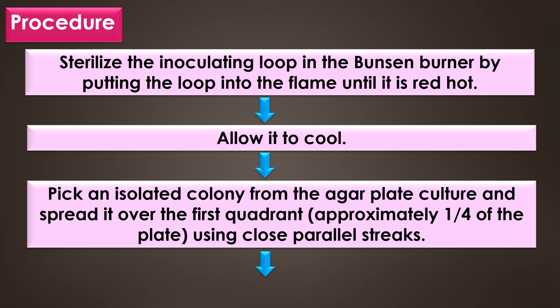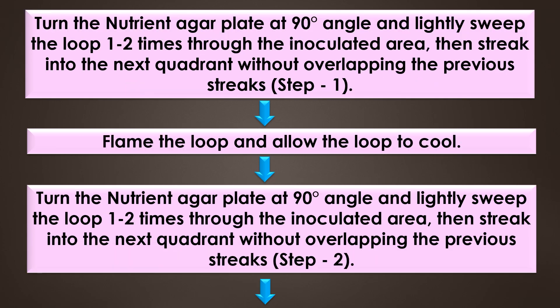First, sterilize the inoculation loop in the Bunsen burner by putting the loop into the flame until it is red hot, and then allow it to cool. After that, pick an isolated colony from the agar plate culture and spread it over the first quadrant, approximately one-fourth of the plate using close parallel streaks. Then turn the nutrient agar plate at 90 degrees and lightly sweep the loop one to two times through the inoculated area, streaking into the next quadrant without overlapping the previous streak. This is step one.